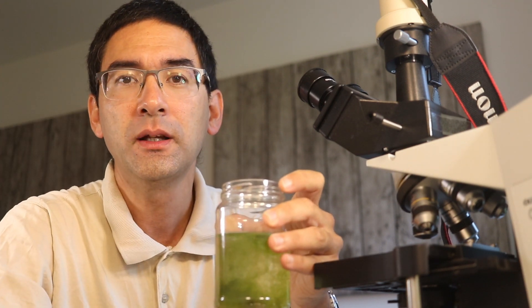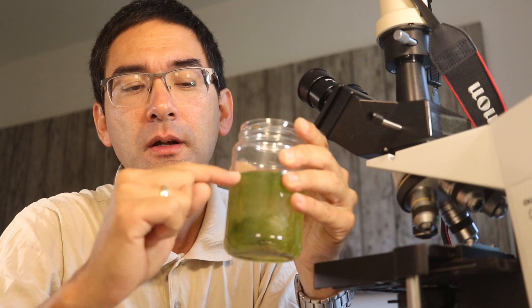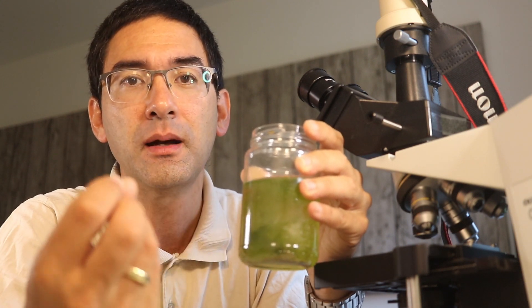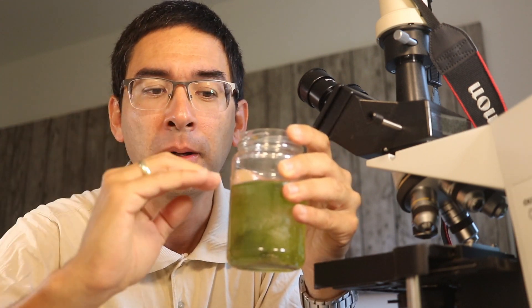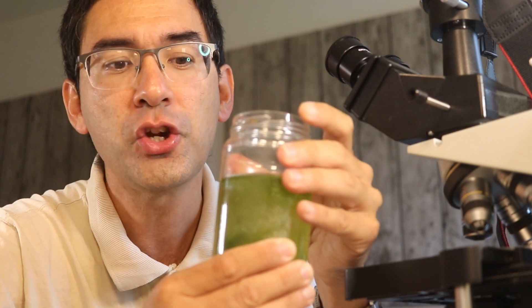How can we make sure that the pond water in a jar stays fresh as long as possible? You have to make sure the oxygen concentration is sufficiently high, and there are two ways to do that. Number one: keep the pond water uncovered — simply keep the lid away. This allows oxygen to diffuse in, creating an oxygen gradient where the top part of the water has more oxygen than the bottom. Sometimes you can see microorganisms accumulating at the top, even forming a layer, because they want to reach the oxygen.